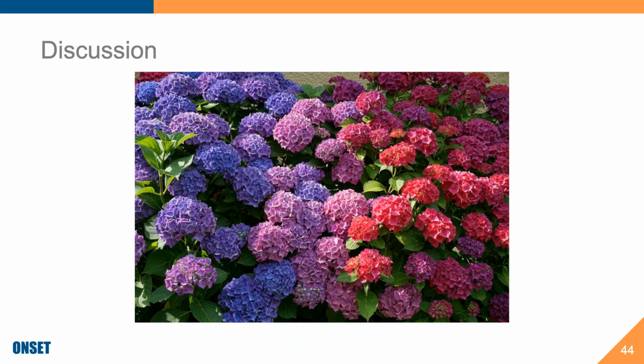So in the case that storage solution isn't available, then the next option that we would prefer would be a pH 4 buffer because it is a salty acidic solution. And if pH 4 buffer is not available, then pH 7 buffer. And then again, if you don't have pH 7 buffer, I mean, tap water would be preferable before distilled water.